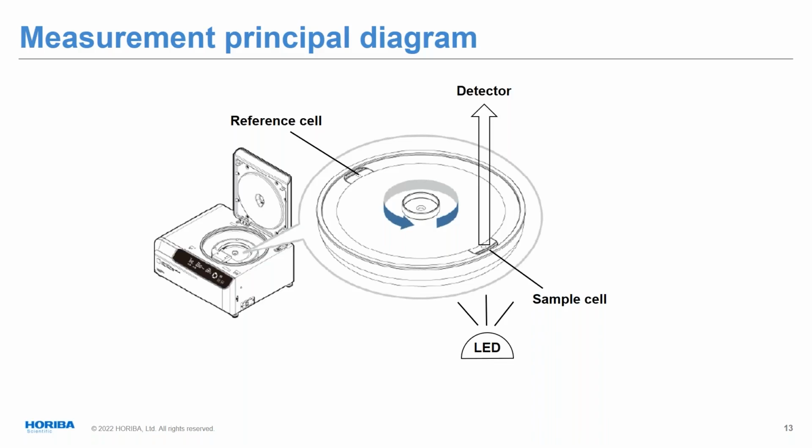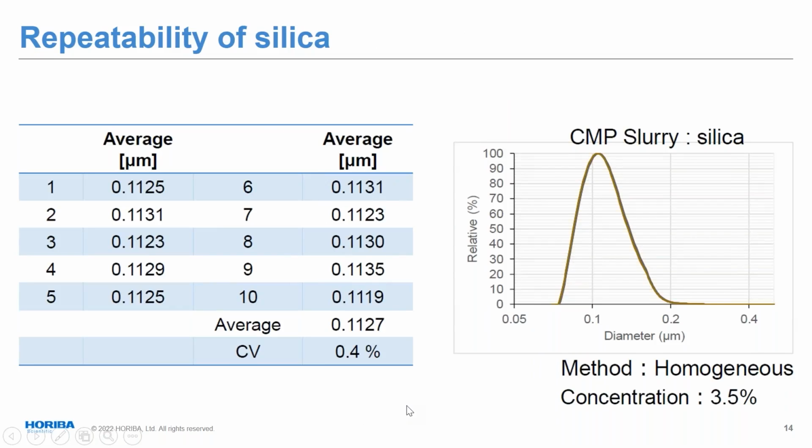The other benefit to this is that your detector can sense every time the light is coming up through the cell. It's just sitting there saying, okay, every 2 times that I see light coming up from the cell, that means 1 revolution of my centrifugal disc. By sitting there over time and counting how many times the centrifugal disc has sent a signal up to the detector, you now know what your number of RPMs is. And this is how the gradient mode operates. It's changing all the time to get up to 18,000, and then it just stays there. But this allows you to monitor continuously what that centrifugal speed is, so that it gives you accurate determination of Stokes Law.